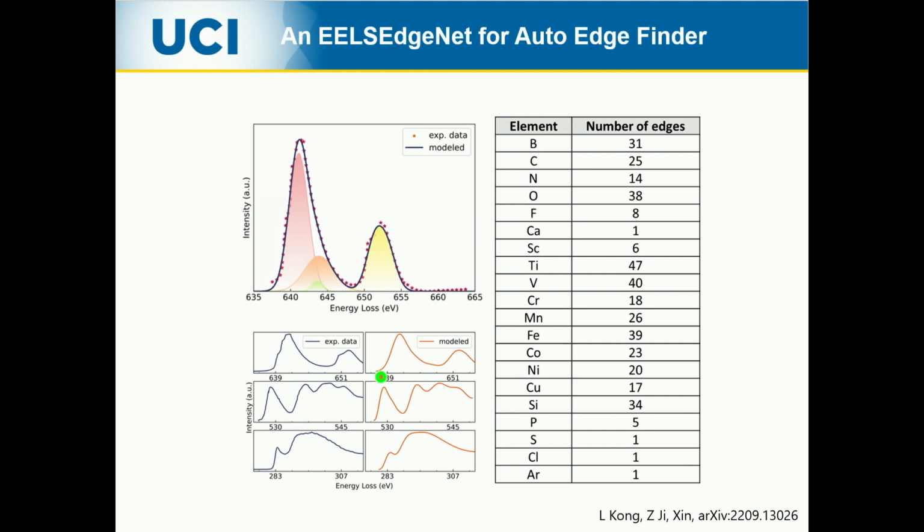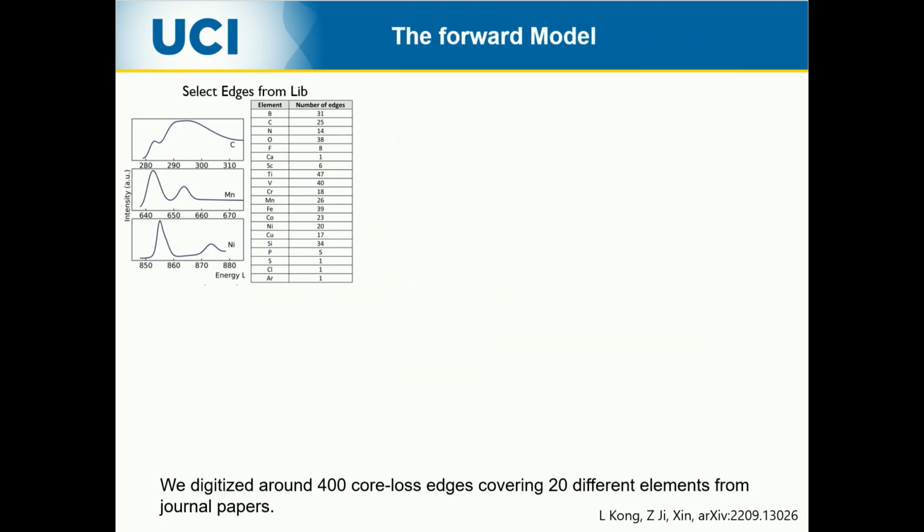So on the left are the experimental spectra, and we basically smooth it a little bit because we don't want noise in the no-noise spectrum, period, and we want to add noise later, so we know exactly what the PSNR or whatever the noise is. And so these are the edges, right?